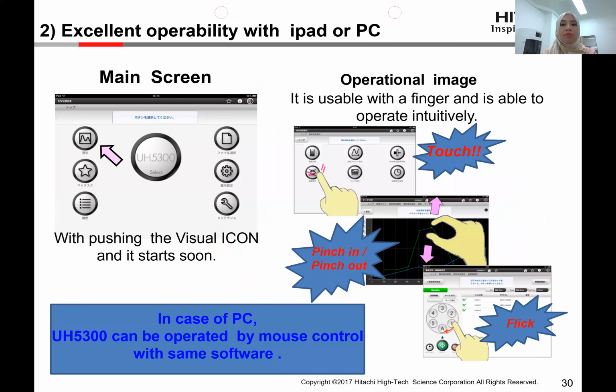For this, we can actually have a touch screen, so it's really easy for you. As you can see up here, you can pinch in and out, you can touch, you can flick using your fingertips. We're going to share with you how we do it in a video later.